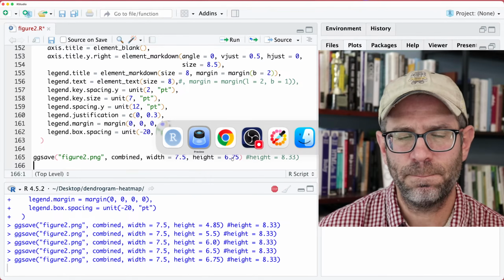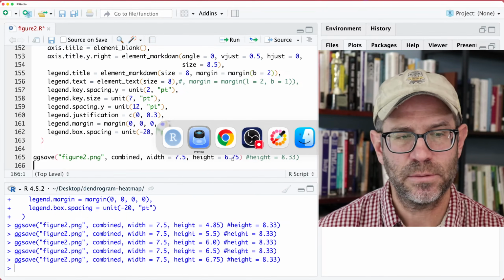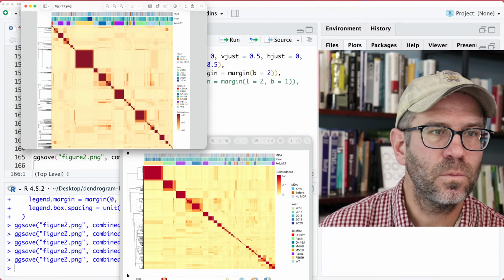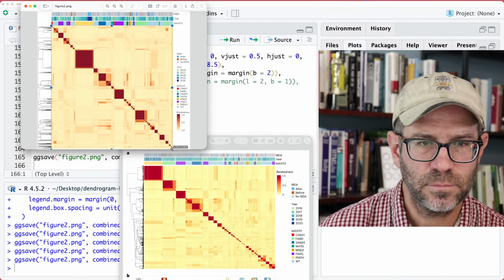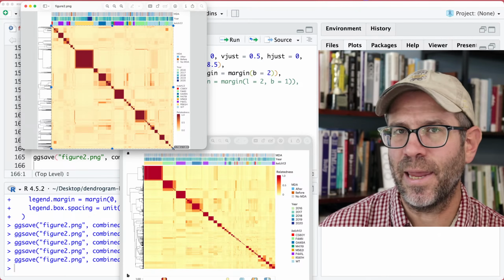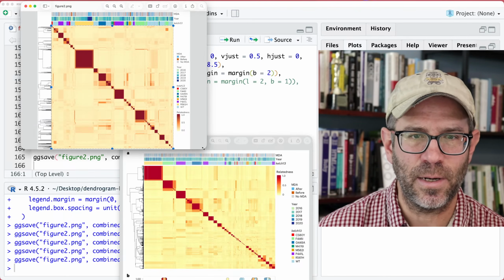And this should be pretty bang on for squareness. If I look at the dimensions here, I've got 1798 by 1804. That's about as good as I'm going to get, right?